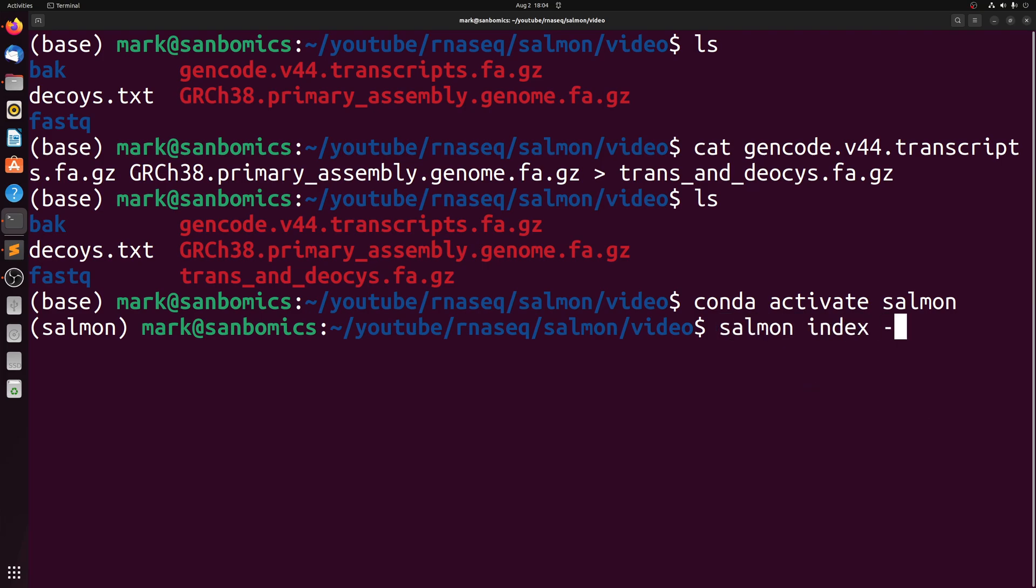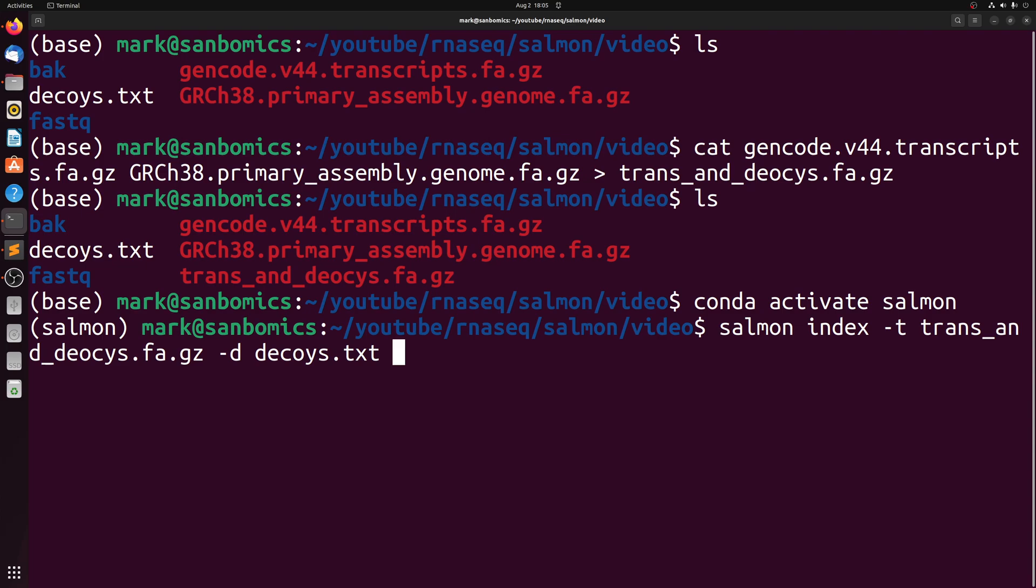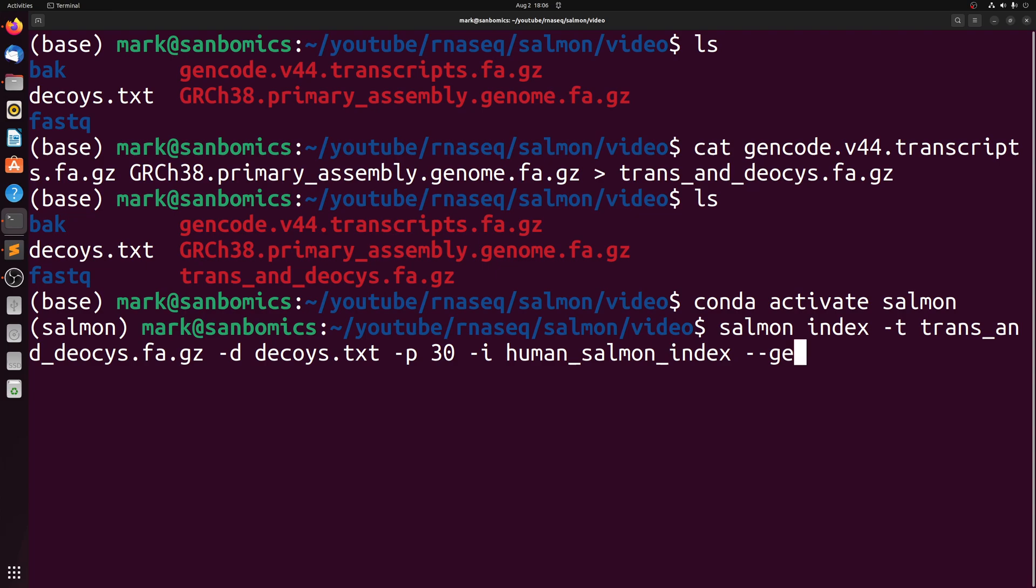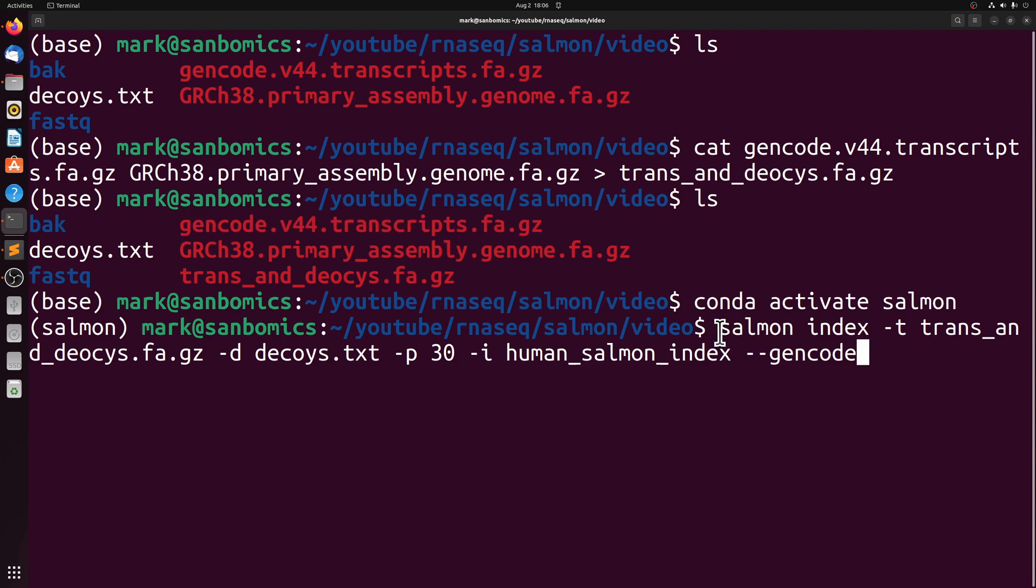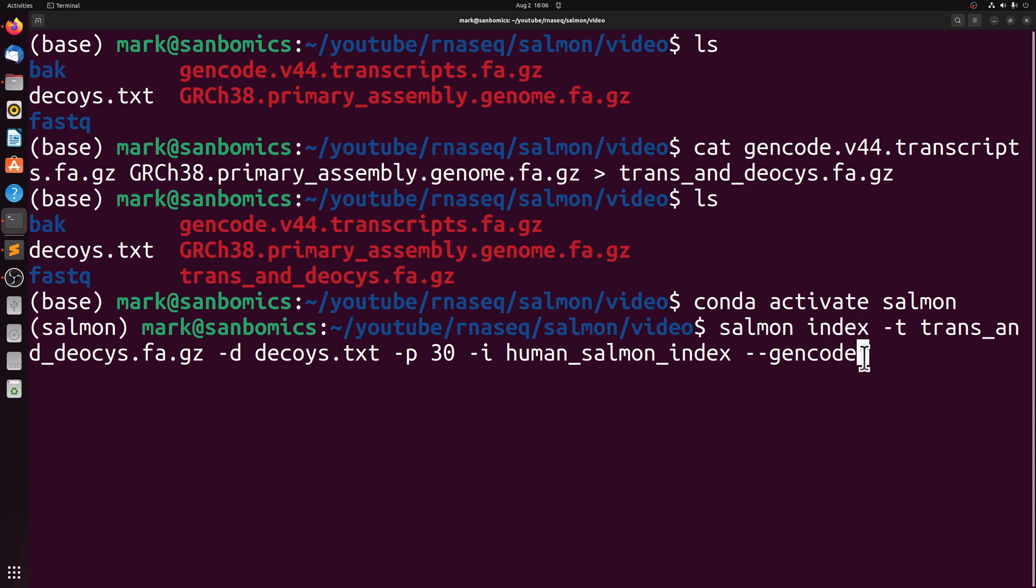We're going to use dash T and pass the transcript file, which is the one we just made, and then dash D for the decoys text. And then you can do an argument for how many cores you want to use. This will just help to speed it up. And then dash I will be the output directory for the index. And then we have to specify in this case GenCode because the delimiters in the transcript file are bars and by default salmon index is looking for spaces.